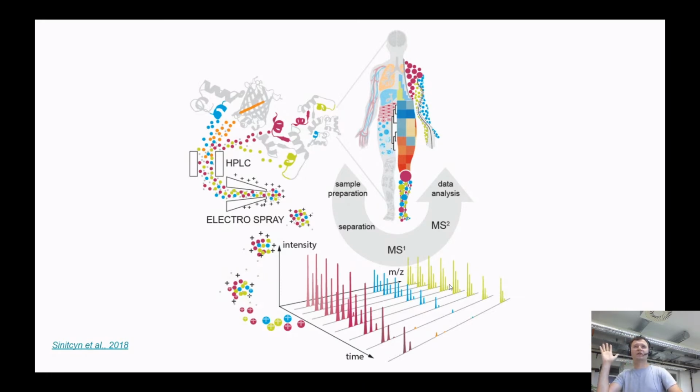On measuring a spectrum, we're spending 20 milliseconds of each second. So basically, it's pretty enough time. We are collecting these peptides and measuring all together at once. So cool. And as a result, doing this every second, spending the first 20 milliseconds of each second, we can really see that some peptides start disappearing from the column.